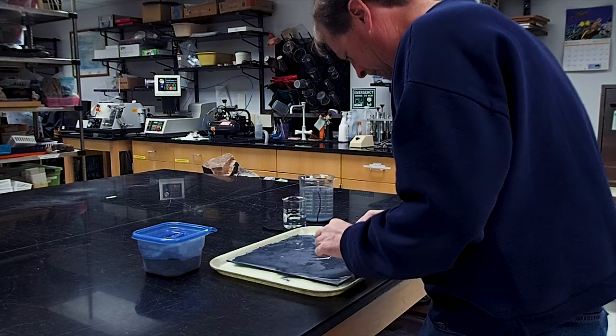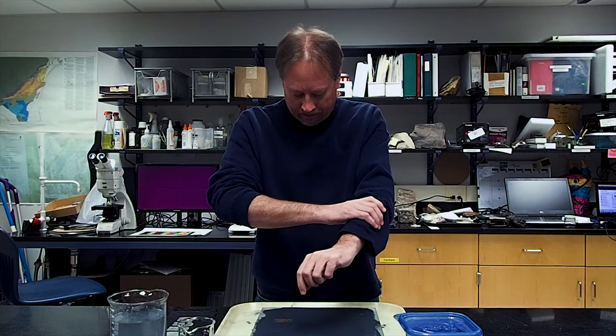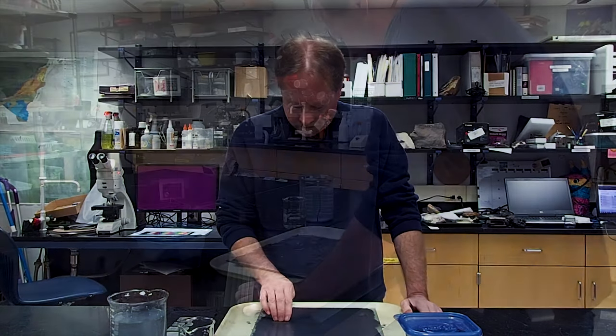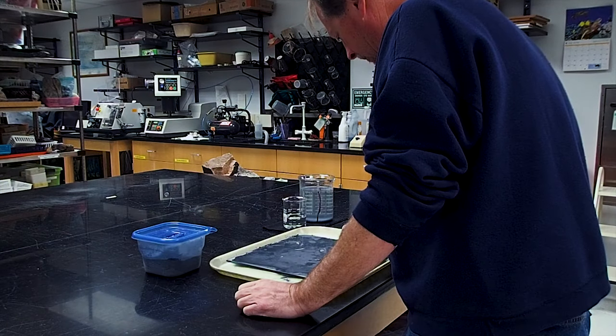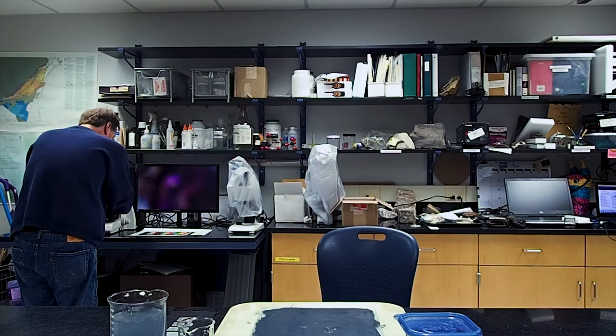Continue this process of grinding and checking beneath the microscope for each of your samples until the interference colors of identifiable minerals match the known colors at a thickness of 30 microns. For example, quartz, a very common mineral, should show a maximum interference color of a pale straw yellow. However, if you're just starting out, don't hesitate to ask someone who is experienced at identifying minerals in thin section for guidance.